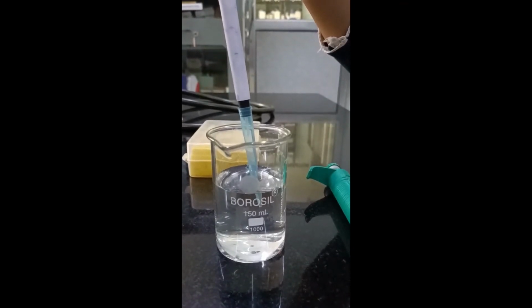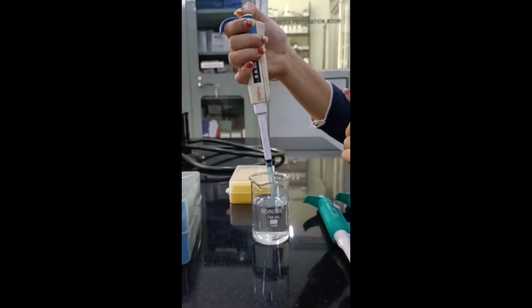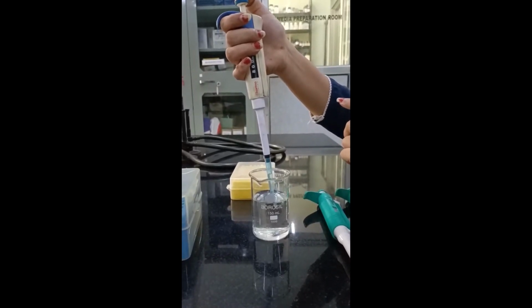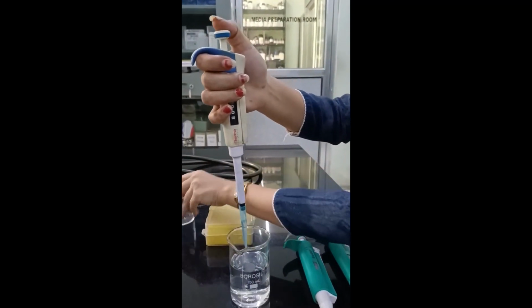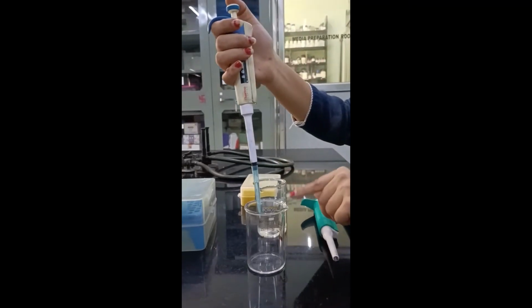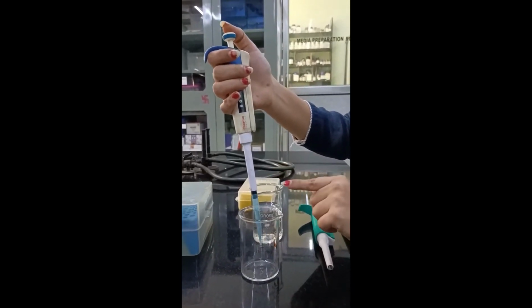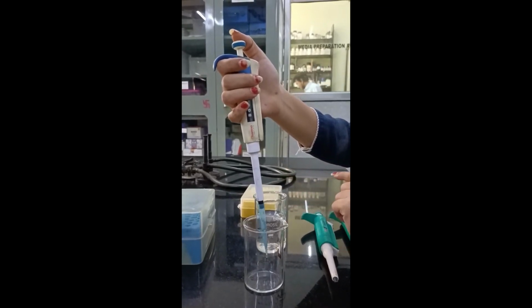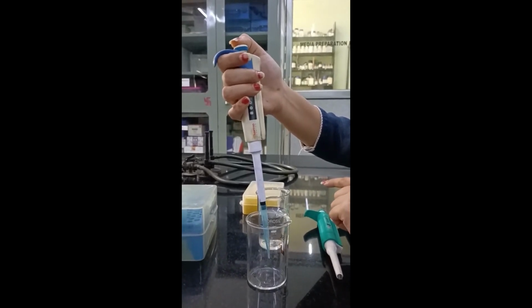Now to take the solution, you need to release the pressure which you have applied at the top end, over here. So slowly release the pressure. As you are done slowly releasing the pressure, I am going to withdraw this particular volume into another container. Again over here I need to apply pressure to withdraw the fluid from the micro tip of the micropipette into another container. Single press, no double press, something like that.